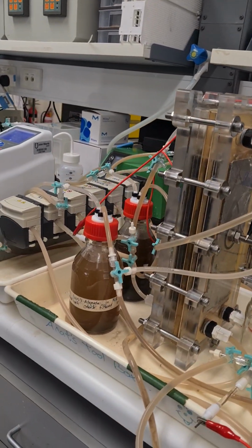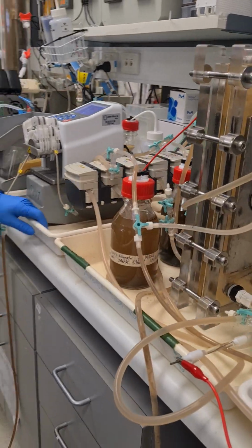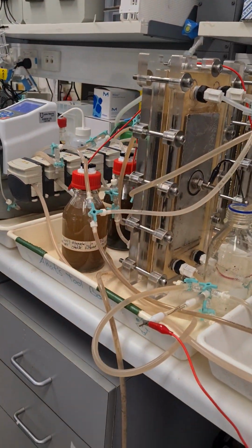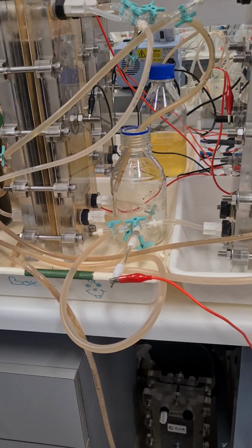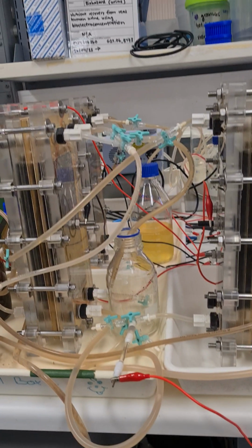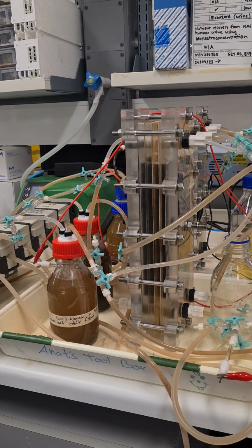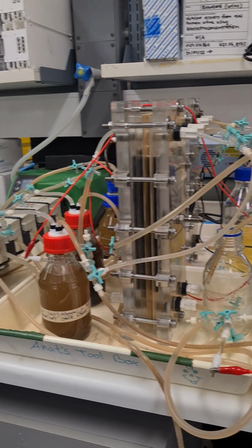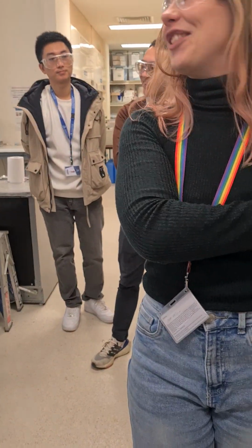We use granules as the anode to provide a lot of surface area for the bacteria to grow. Currently, the cathode is just a stainless steel plate. One of the reactors is operated continuously, so it's being fed hydrolyzed urine from the urinal that you just used. I think. Thank you very much. We dumped water and caffeine in it. I think very little nutrients.